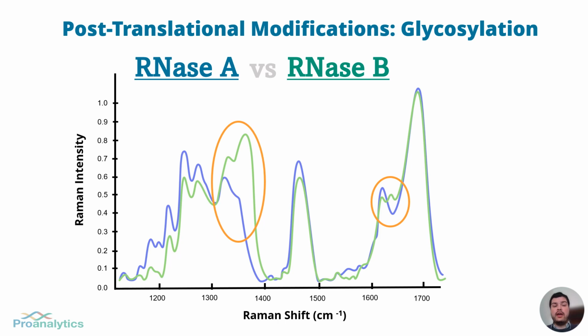B. Unlike the upstream one, these are purified samples, so the solution is more binary, just the proteins in the same buffer. It's not like the metabolite analysis where you are capturing multiple Raman profiles of everything in the soup. And the limit of detection is about 120 parts per million in this study.